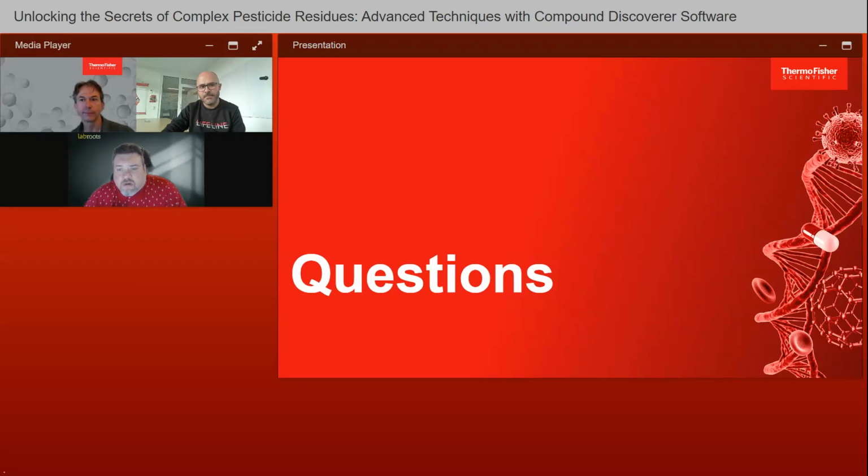All right. Another one for you. Why is sensitivity important for the residues with MRL complex definitions? It is very important. It's critical because in case of, let's say, an isomer that is included in the complex residue definition, you have to go halfway.